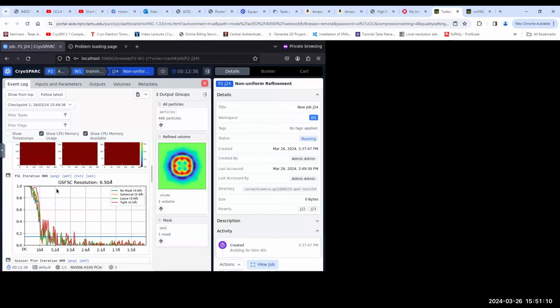And this should go somewhere like this here, because this has 2.5 angstrom resolution. The blue line is showing the cutoff, that is 0.143. So that should go somewhere like this, and this should be the smooth line.